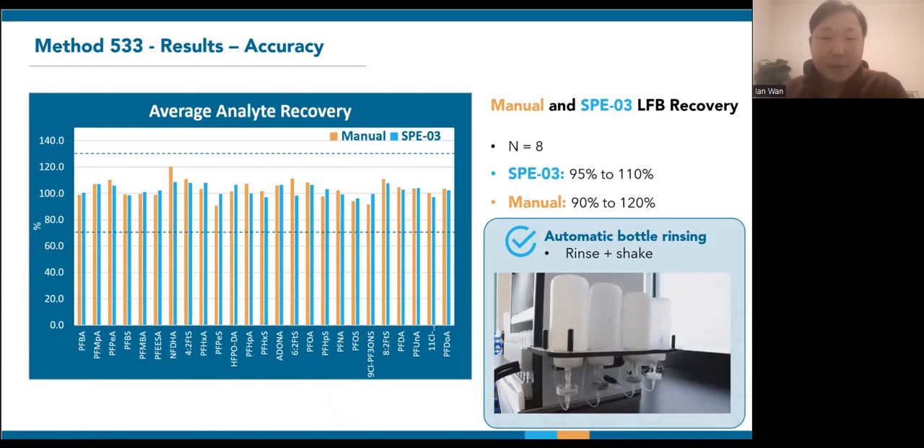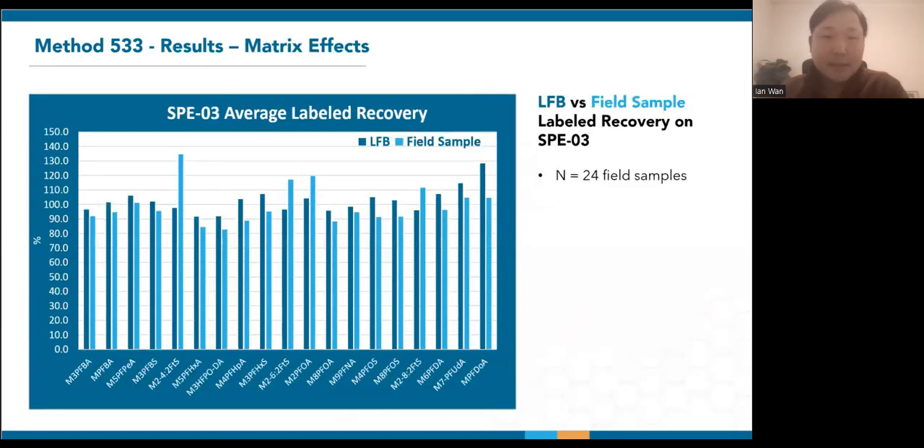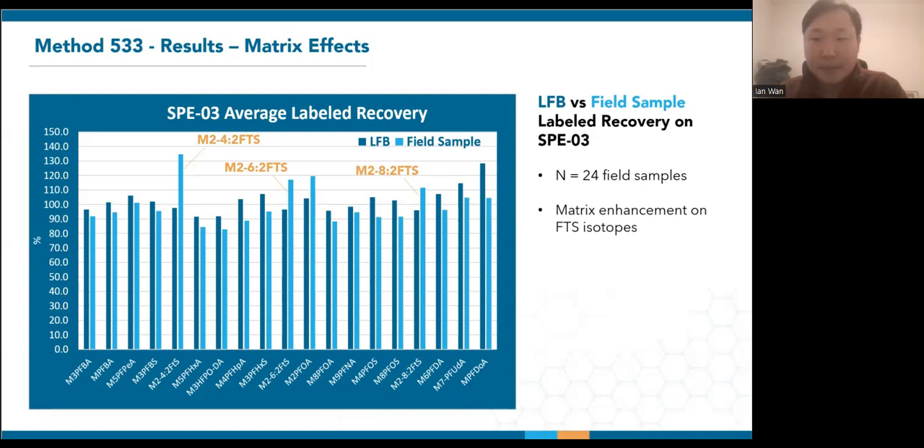Now, how does the labeled recoveries change with real samples? Since method 533 uses isotope dilution, we can compare the labeled compound recoveries of the same 8 LFBs with 24 field samples extracted on the SPE03. If you look at the light blue bars, some compounds are on average more affected than others in the field samples. Most noticeable is that the response of the 3-fluorotelomer sulfonates were enhanced, with the 4:2 FTS isotope on the left having the most significant increase of about 35% overall. This is quite common for samples with more complex matrices, which has to do with the ionization of these compounds. You will see something similar in my next section on EPA method 1633.